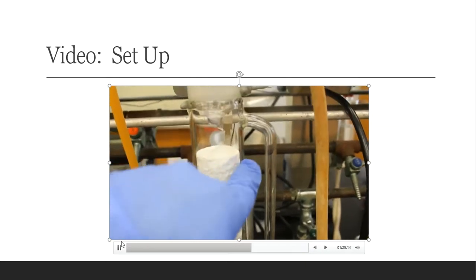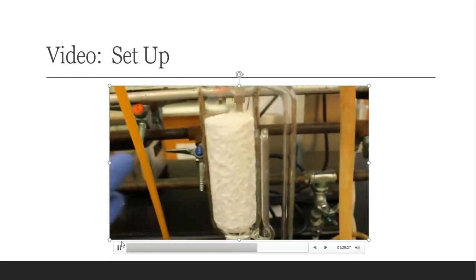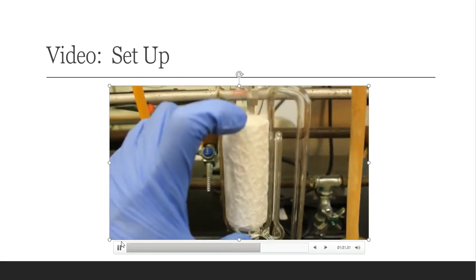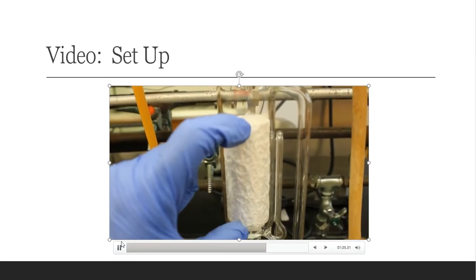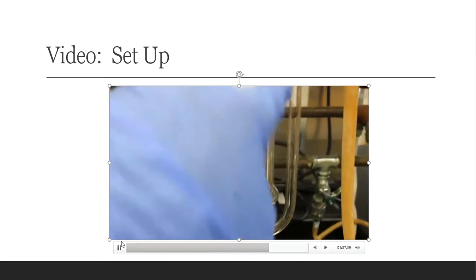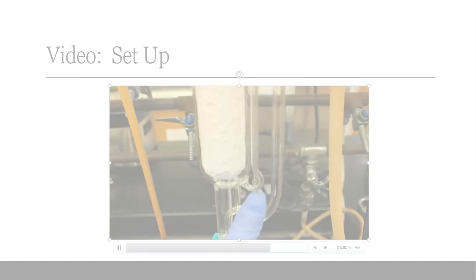Then when my liquid level gets to that point, it will self-drain itself. So all of this ether that has been soaking my peanuts will now be drained automatically, and it will be sent through that piece of tubing and back down into my Florence flask that sits below. And this process is going to repeat over and over and over.